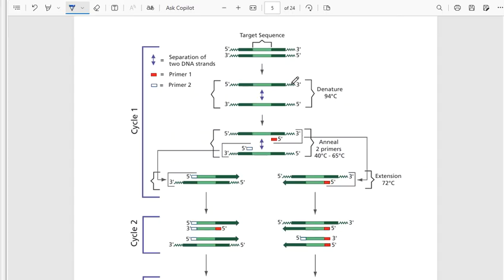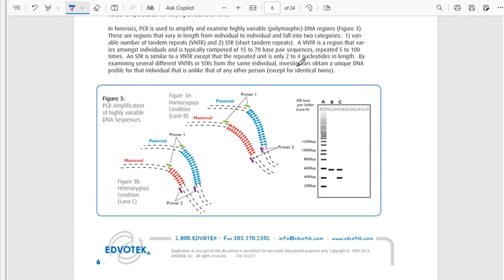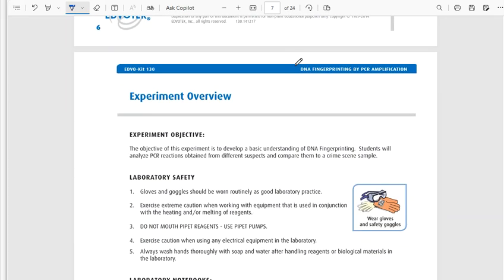But in the PCR, this is where the DNA was split. So those 2 strands were ripped apart. And then we added 3 different temperatures, and we added Taq, and we added primers, and we added bases, and we allowed the replication to take place over a course of time. So heat up, cool down, heat up, cool down, heat up, cool down. And then these were the samples that we have taken into our laboratory that we have run.